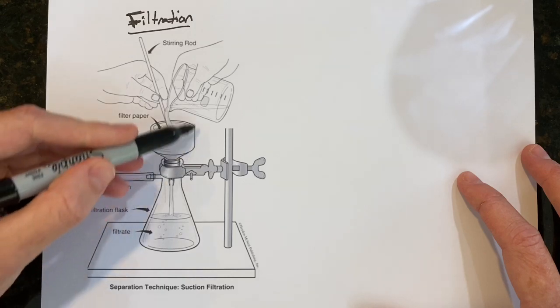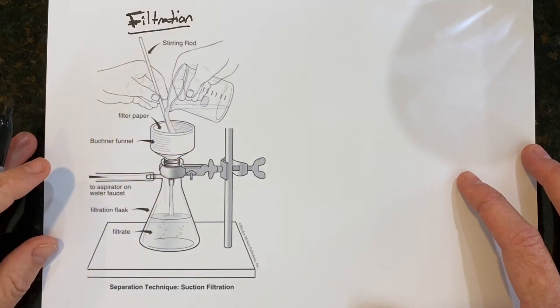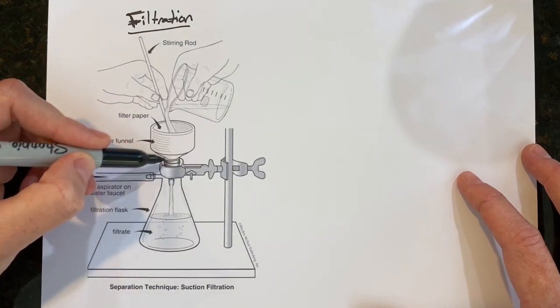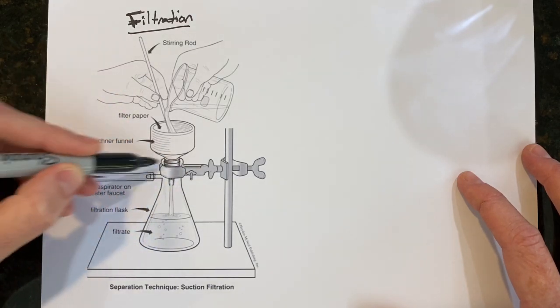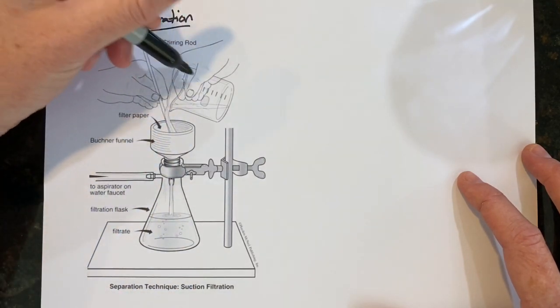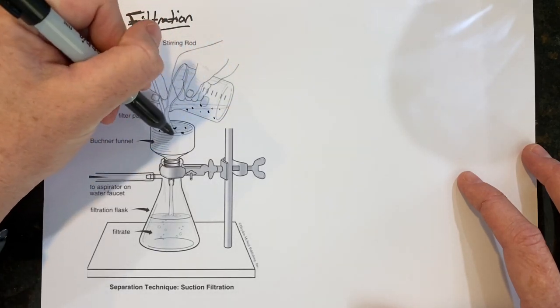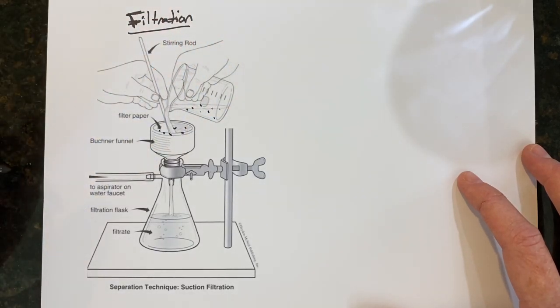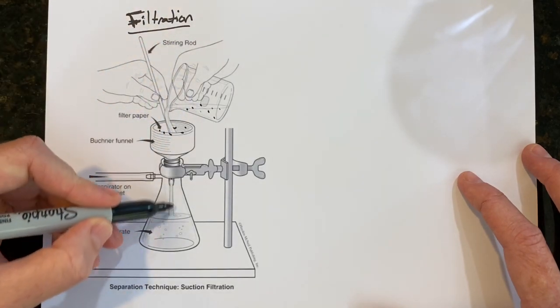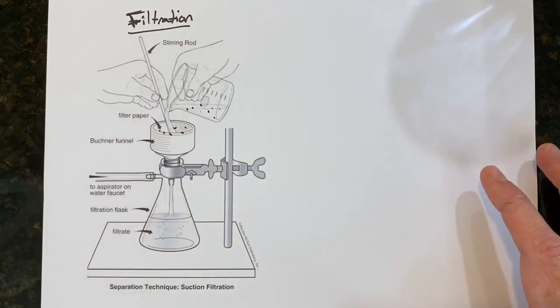Here, this is called a Buchner funnel. It's a funnel that can withstand the pressure of a vacuum. And it's connected with a little rubber stopper here, and it's just going to go all the way through, and the filtrate's going to come out, and all the little solid or whatever happened to be in the solution will end up on the filter paper down there. Again, you want to use a stirring rod to kind of direct it. The liquid will come right through here, keeping the solid in this particular area.